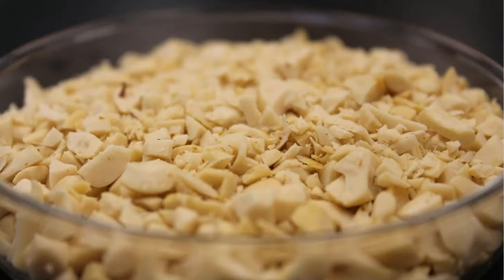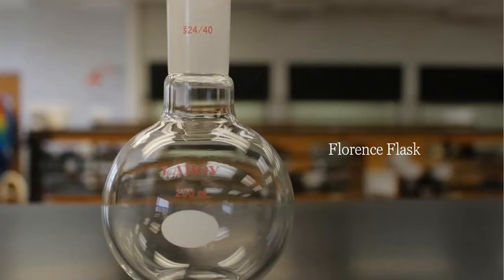Okay, so now that the nuts are in the oven, now that they're roasting and I'm evaporating some of that water off, I then turn toward the setup of the Soxhlet. This is going to require a few pieces. Number one, a Florence flask is going to be chosen. The Florence flask here is a 250-mL Florence flask, and it's a Florence flask because it's flat on the bottom. This is not a round bottom flask, folks. A round bottom would be perfectly round on the bottom. That's why they call it a round bottom. Can you imagine? But this is a Florence flask instead.